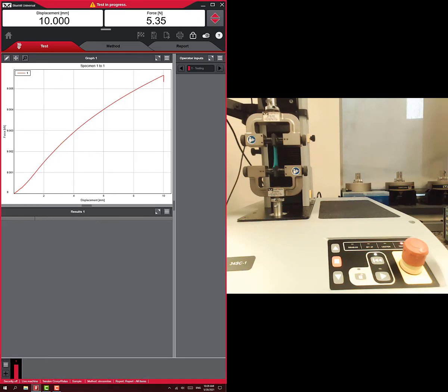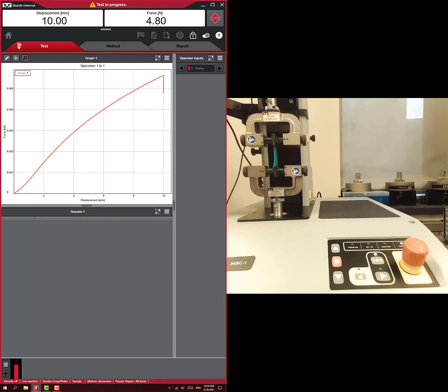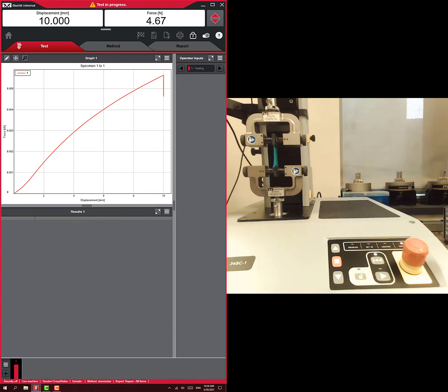Which it did, and now it's holding at 10. And so you can see this glove material is not perfectly elastic. There is some definite stress relaxation going on as the force is decreasing, despite the fact that we're holding at 10 millimeters.